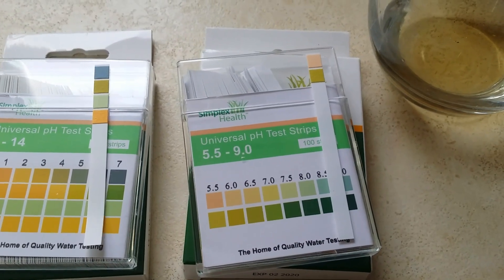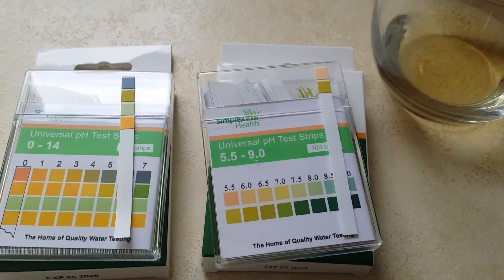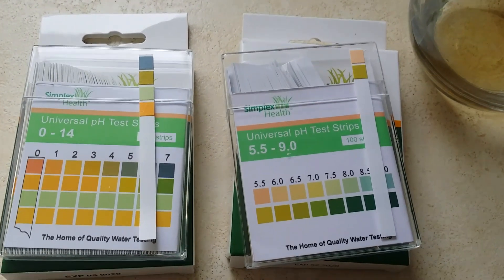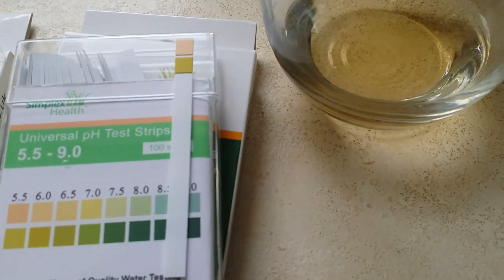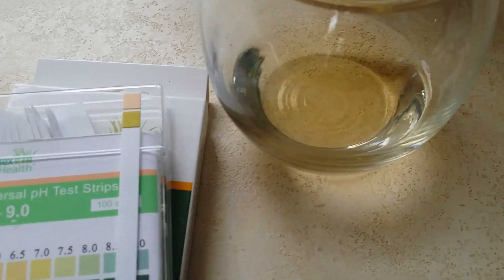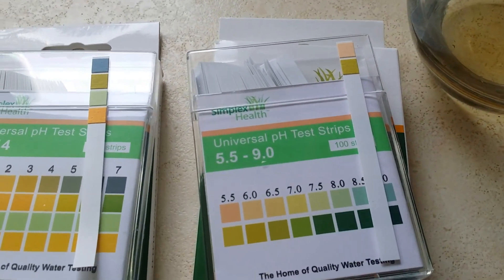Hi, it's John here from Simplex Health. I just want to quickly demonstrate how to use our test strips for testing vinegar. I've got a glass of white wine vinegar here — any vinegar would do. It should have a very low pH.